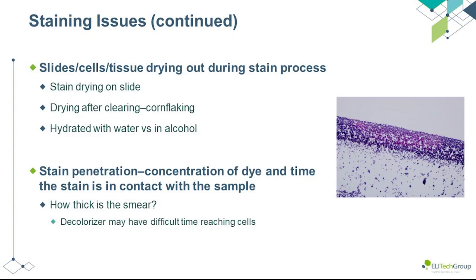Drying out can also lead to formations of precipitate in some cases. It's important to remember that stains dissolved in alcohols are much more prone to drying out due to the alcohol having a higher evaporation rate than water. Drying, in some instances, can leave air pockets on the cells, such as seen in squamous cells, usually during a Papanicolaou stain.